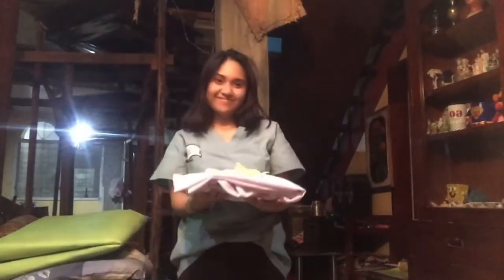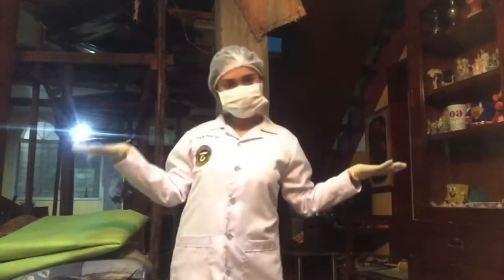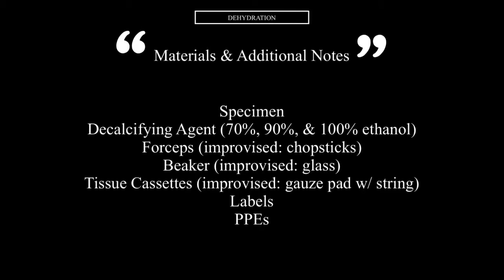Hi, my name is Ronamae Del Mar and I'm in charge of the dehydration process. And now that I'm done wearing my PPE, let's get started! So before we actually proceed to the dehydration procedure, let me first give you an overview of the materials to be used and some additional notes that are very vital in this procedure.